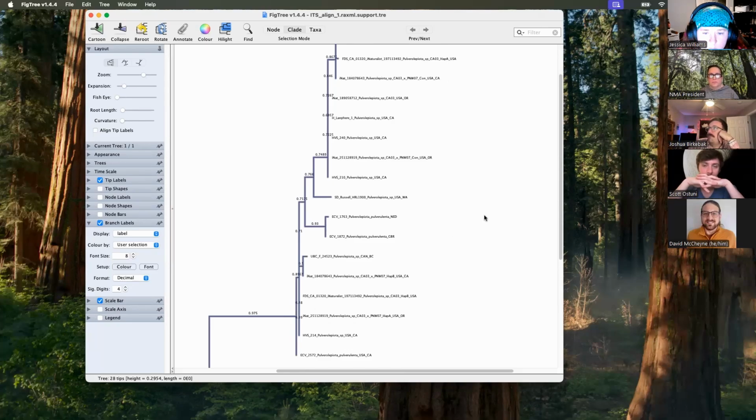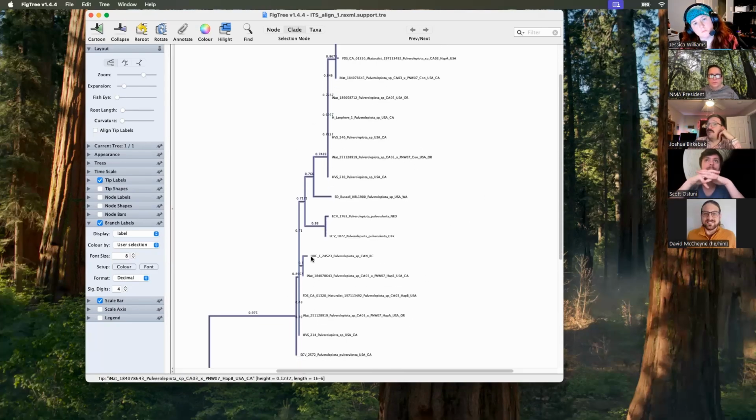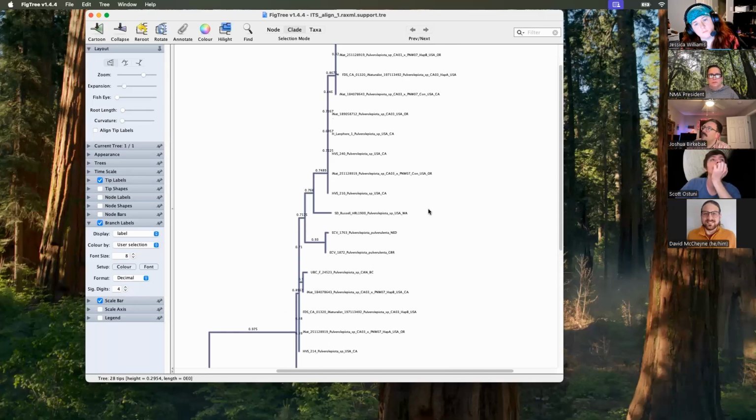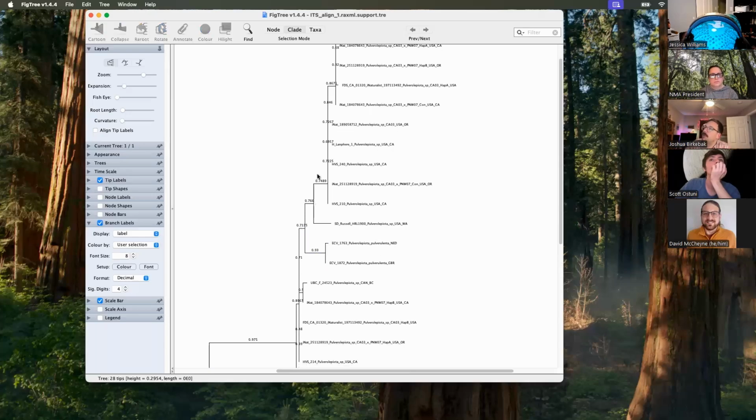So basically, based on just this, we see that there are a lot of differences. It doesn't necessarily help us sort this out. We can see there's maybe a cluster up here and a cluster here, and we've actually got these two European sequences well supported together. They're almost identical, and those two are sort of unique. They're not integrating with these other sequences. But the placement between these two different haplotypes is not super strong.